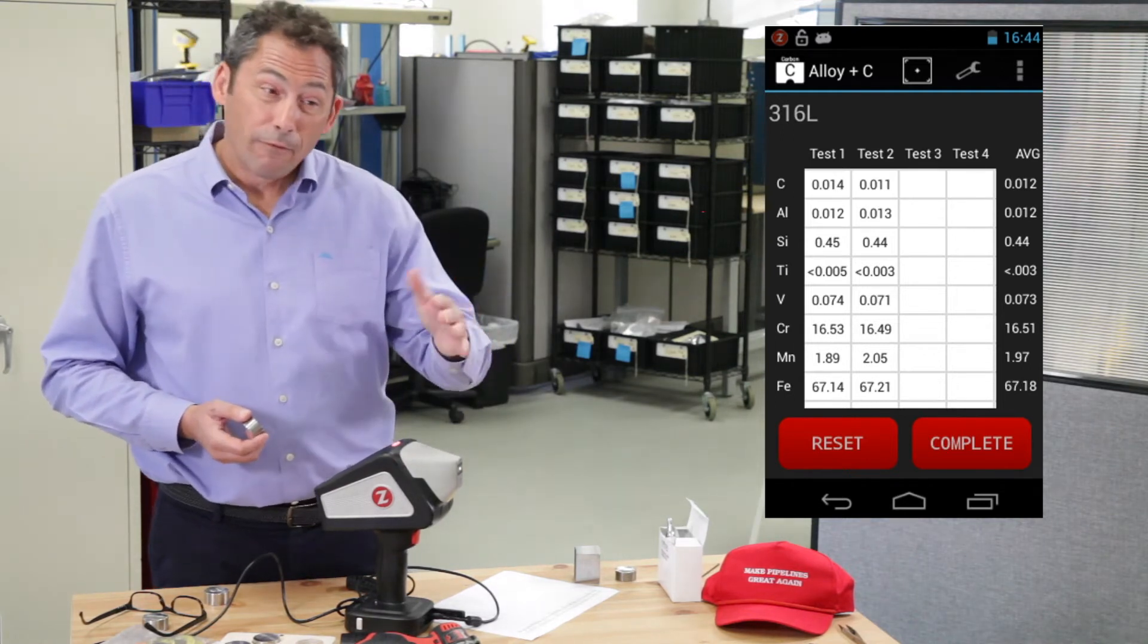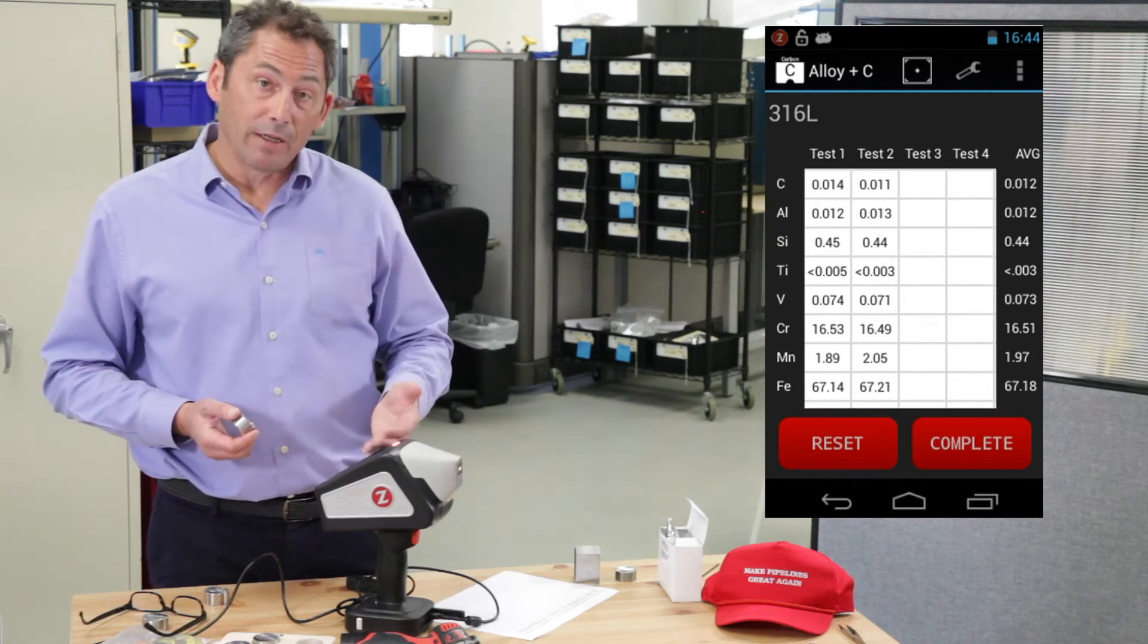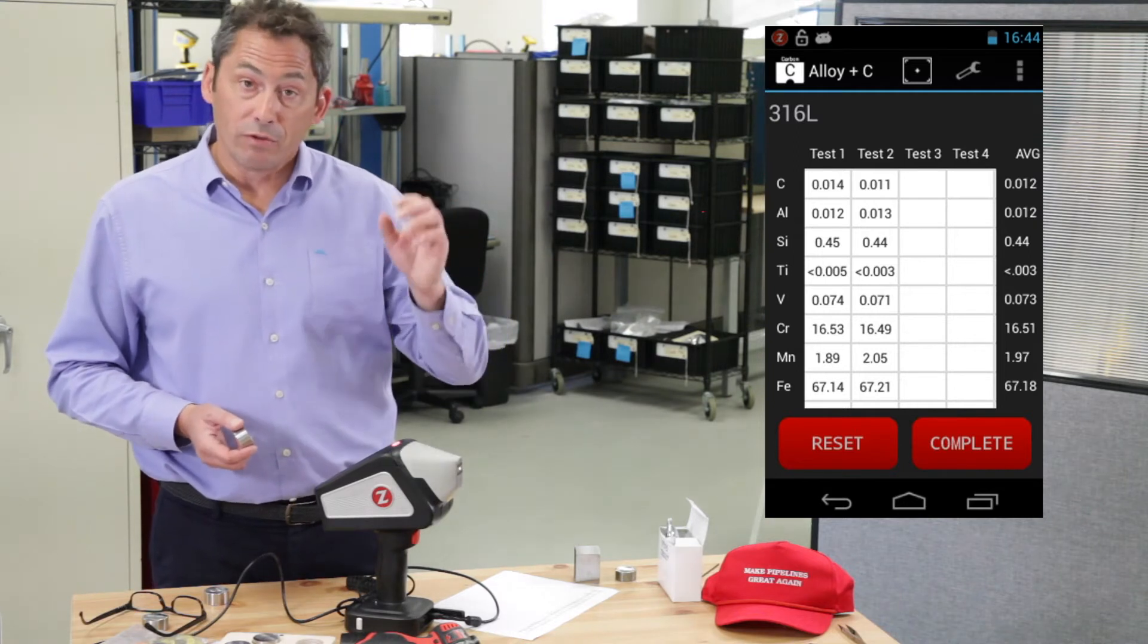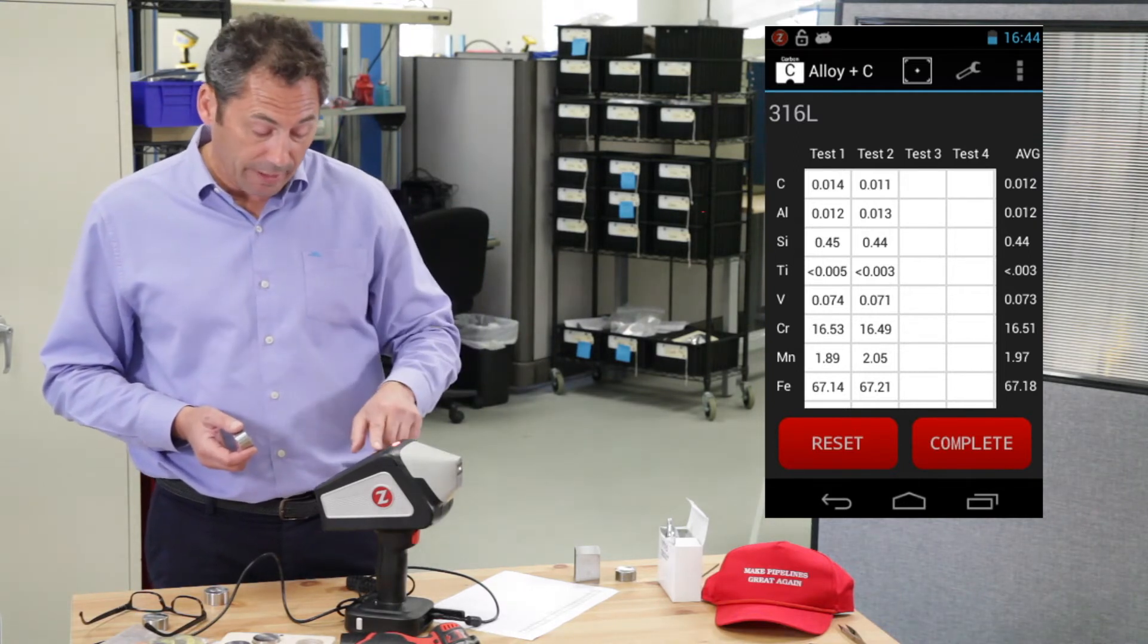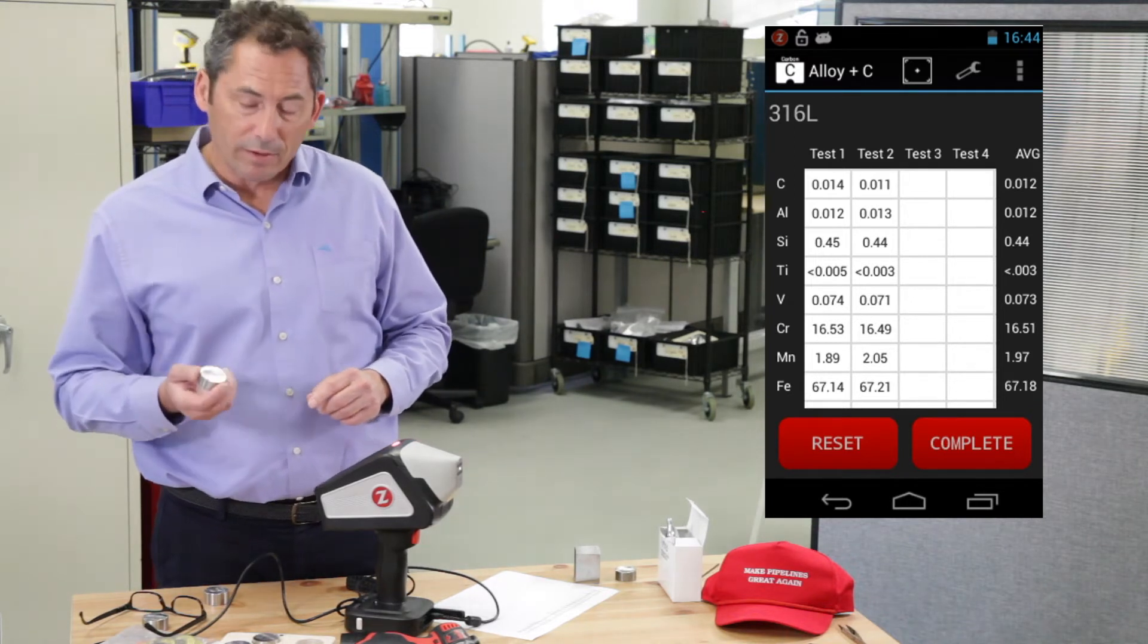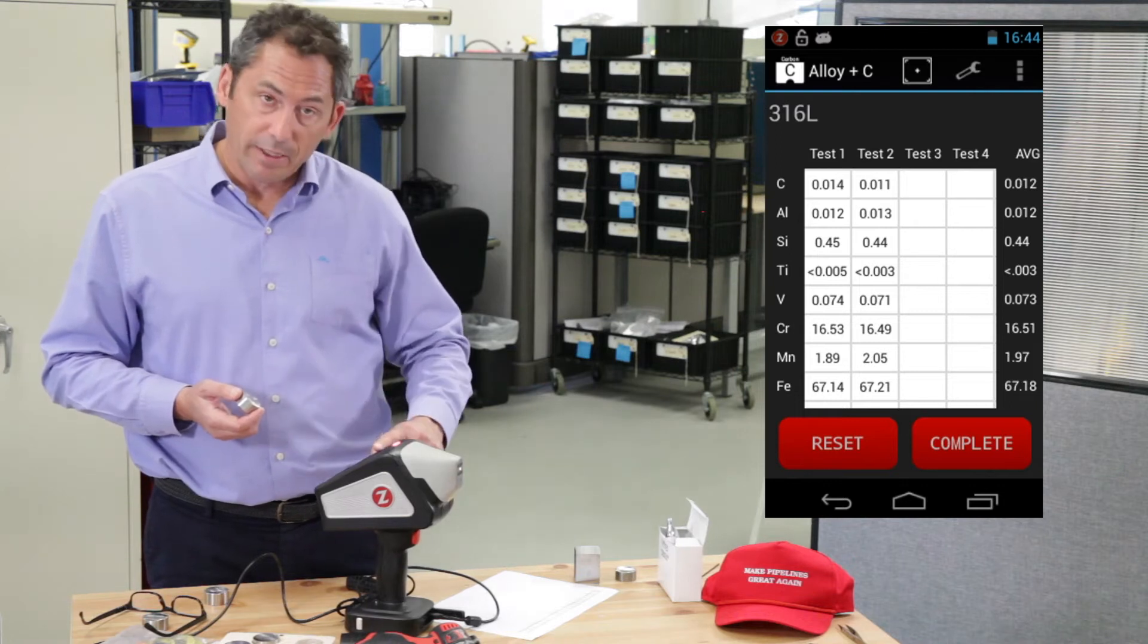We used to run four or five of these tests and average them. Now, generally, we find that our customers can do just two. They can do the pre-burn and they can do two tests and they're done. So they get a first carbon result on an L. I chose this one because it's really low, so it's hard to see the carbon, second carbon result, and they're done.